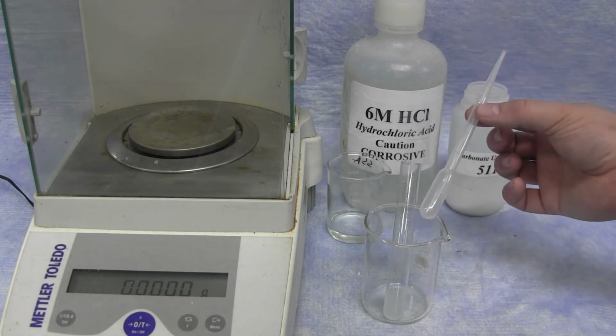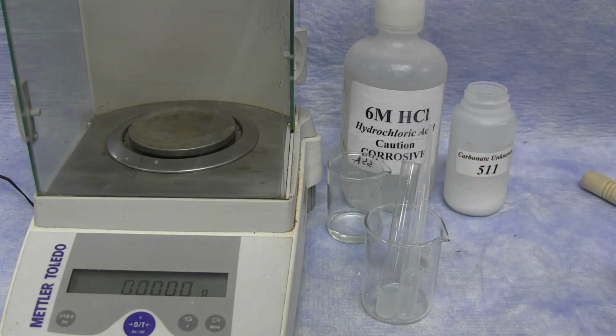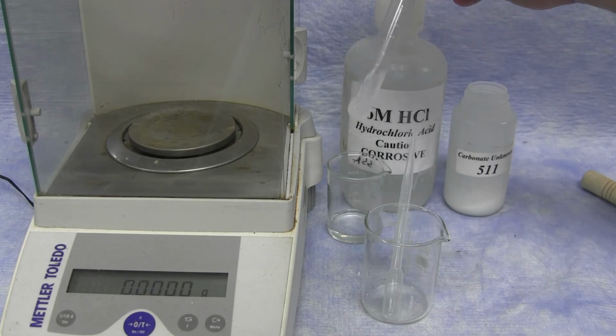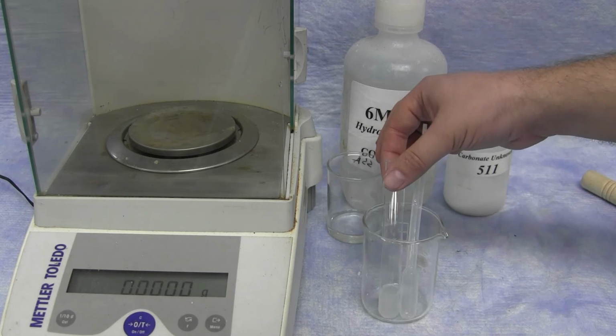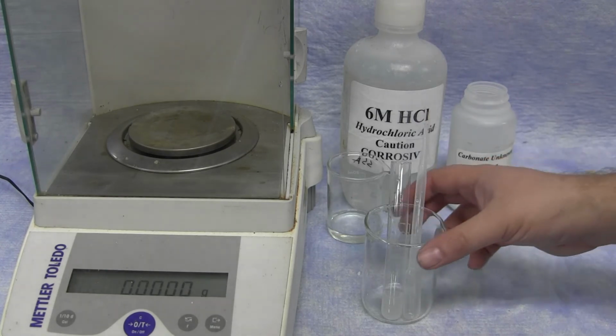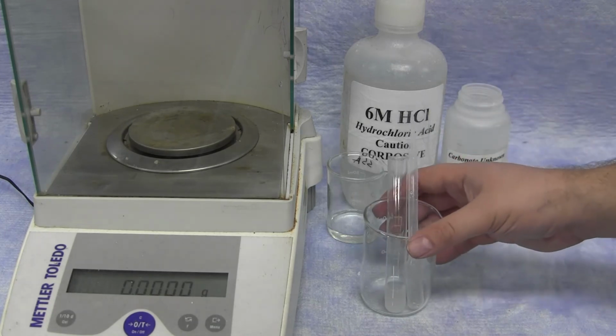There is plenty of hydrochloric acid to react with all of the carbonate sample. However, you may also see that it is still a little cloudy. This is an indication of the solubility of the resulting chloride salt, sodium chloride, or whichever chloride it happens to be.